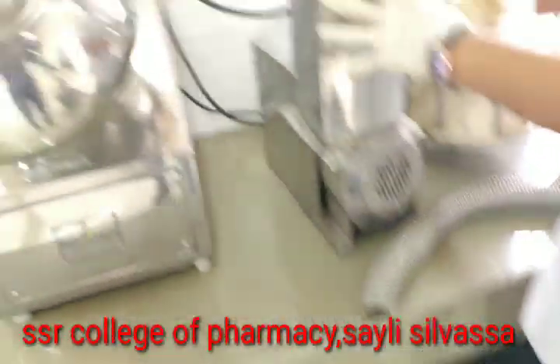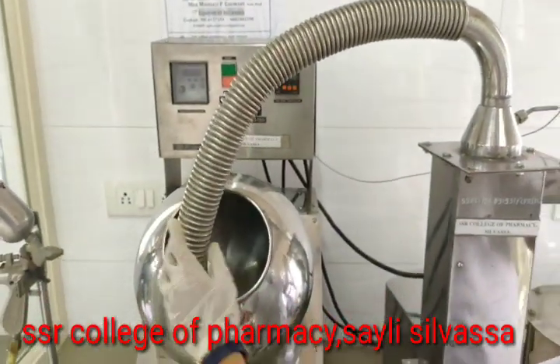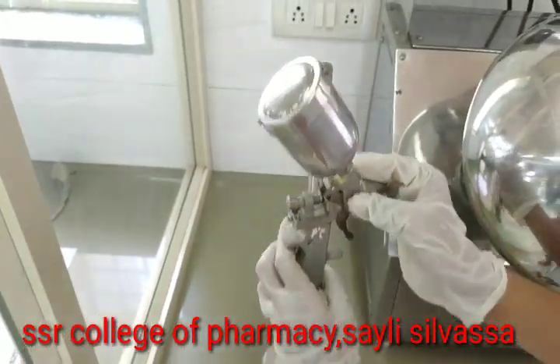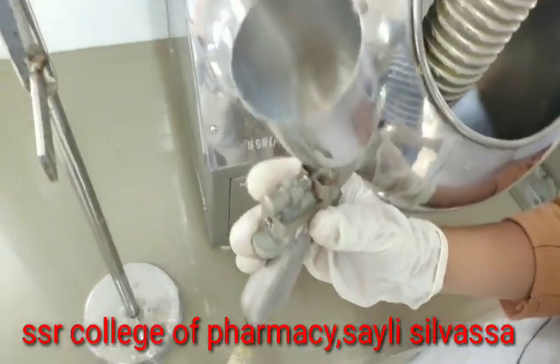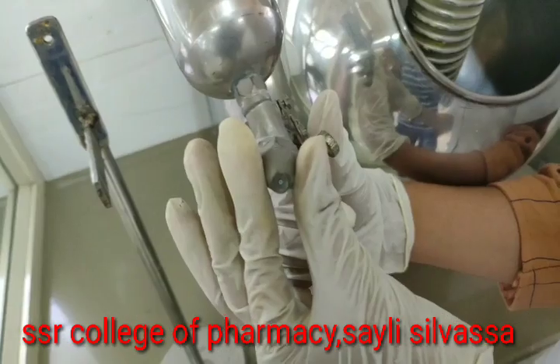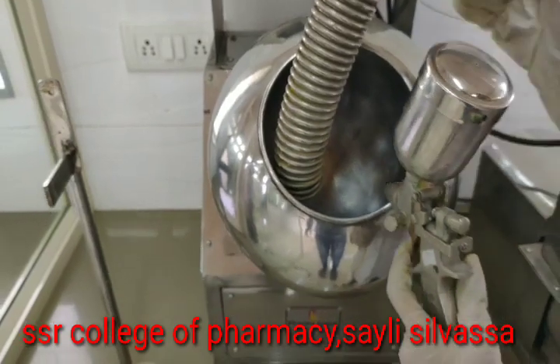This is the hot air blower. We can connect this pipe to the pan for hot air supply. This is the container in which we fill the spraying solution — we close it, press it, and from the nozzle the spraying solution will be sprayed onto the tablets as the pan rotates.